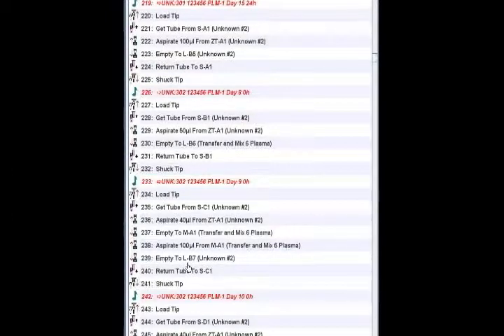Going back to the steps column, notice that transactions are divided into blocks by a comment line that is shown in red. Should a recoverable error occur within a block, that block of action will be aborted. It will be marked in red for correction under operator supervision at the end of the run. The program will then go on to the next block. This allows the formatter to run continuously unattended.